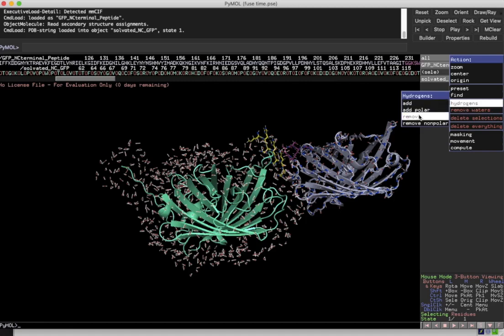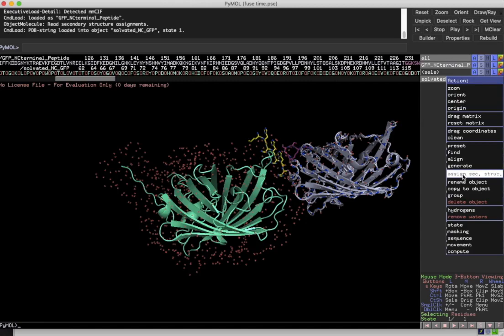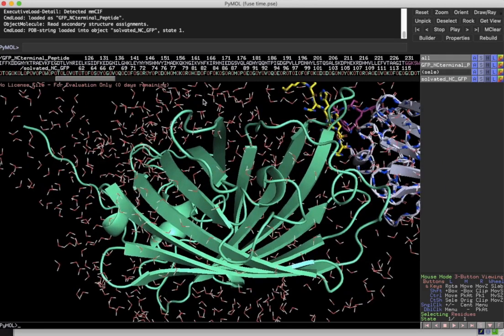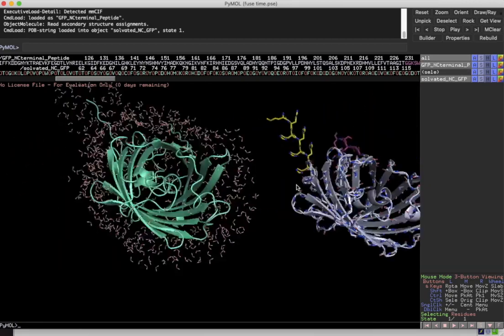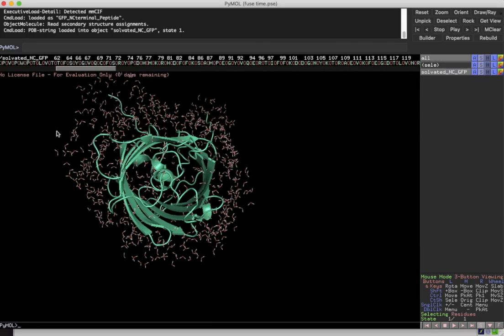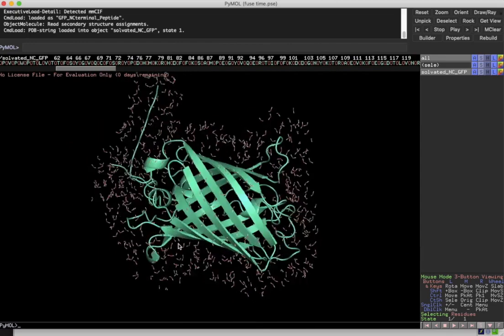So let's go remove the hydrogens, and then let's go ahead and add back hydrogens. You can see now in PyMOL it's not showing the little triangles, it's actually showing water as not having a strange bond between the hydrogens or little triangles. So that's cool. I'm going to go ahead and remove our old molecule that we had developed earlier. So I'm just going to go ahead and delete that object. So we're only working with this one here.